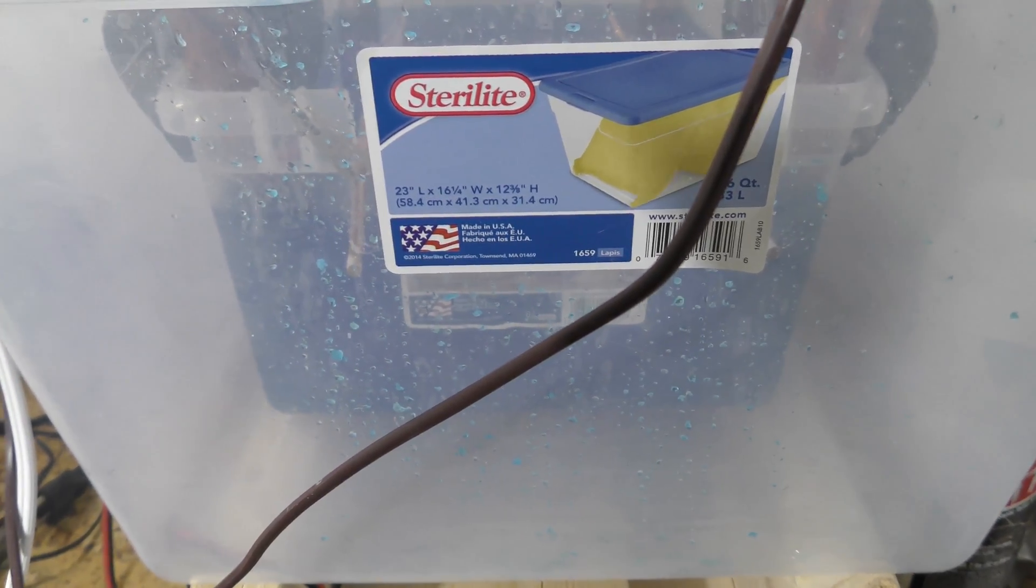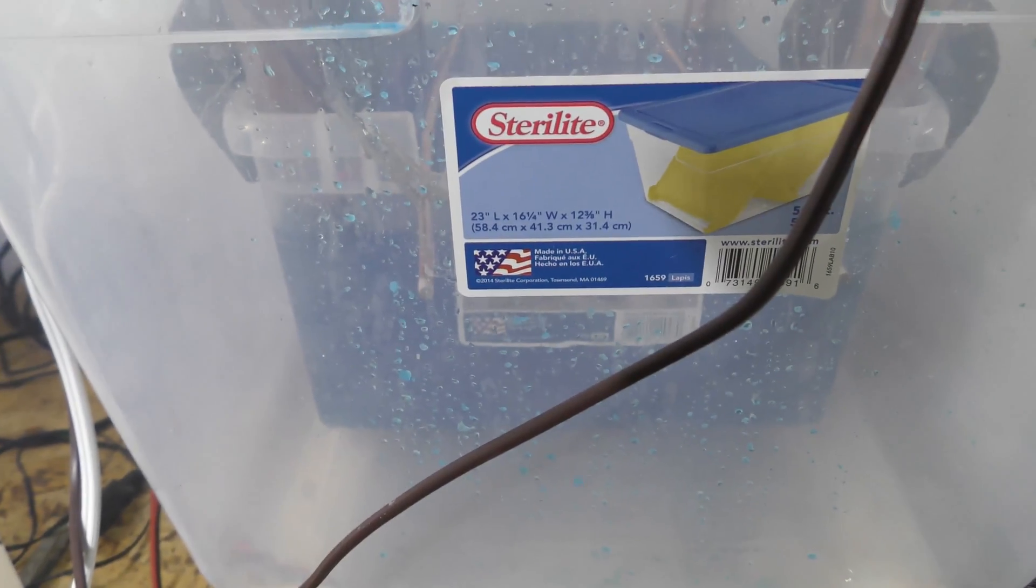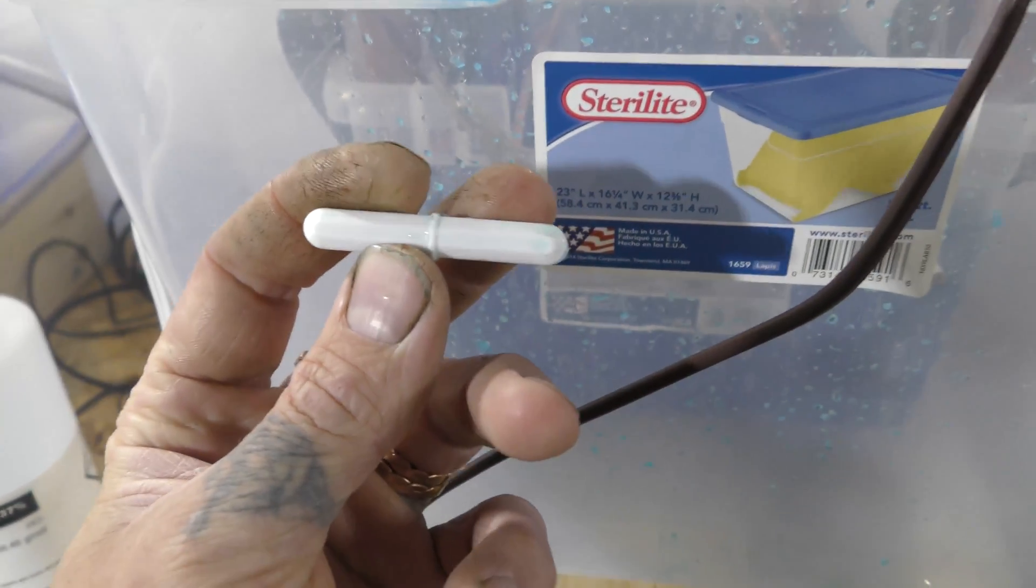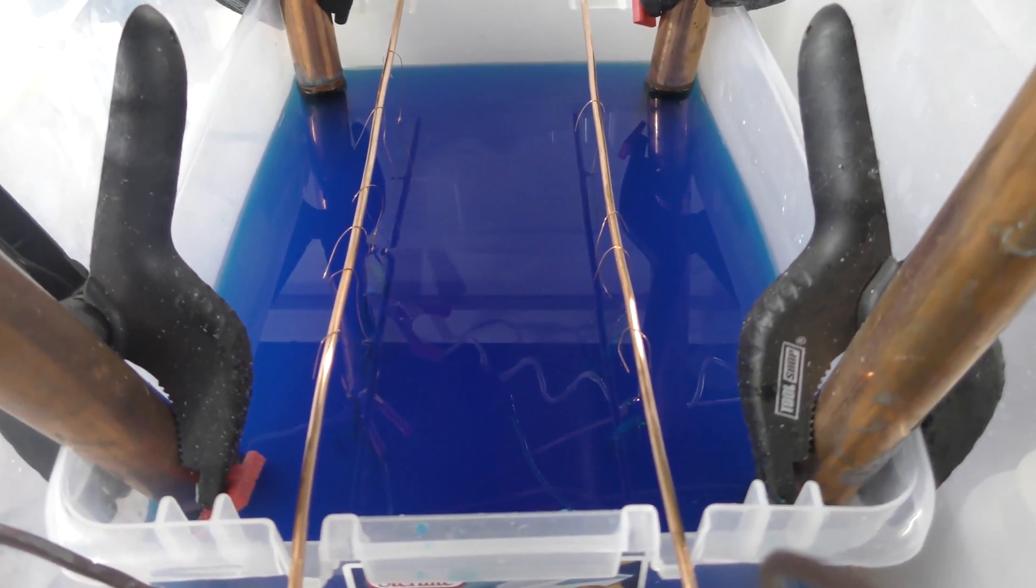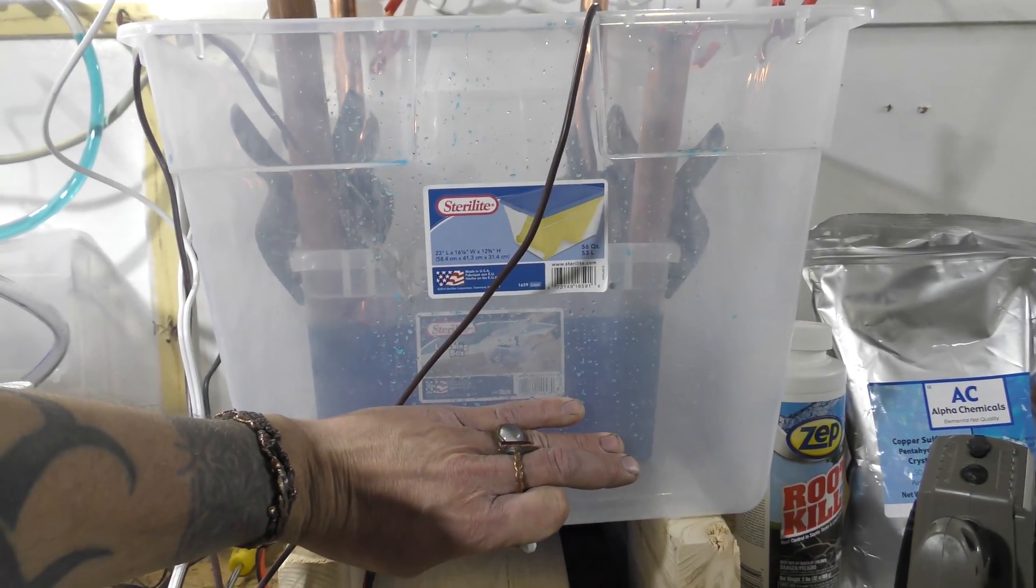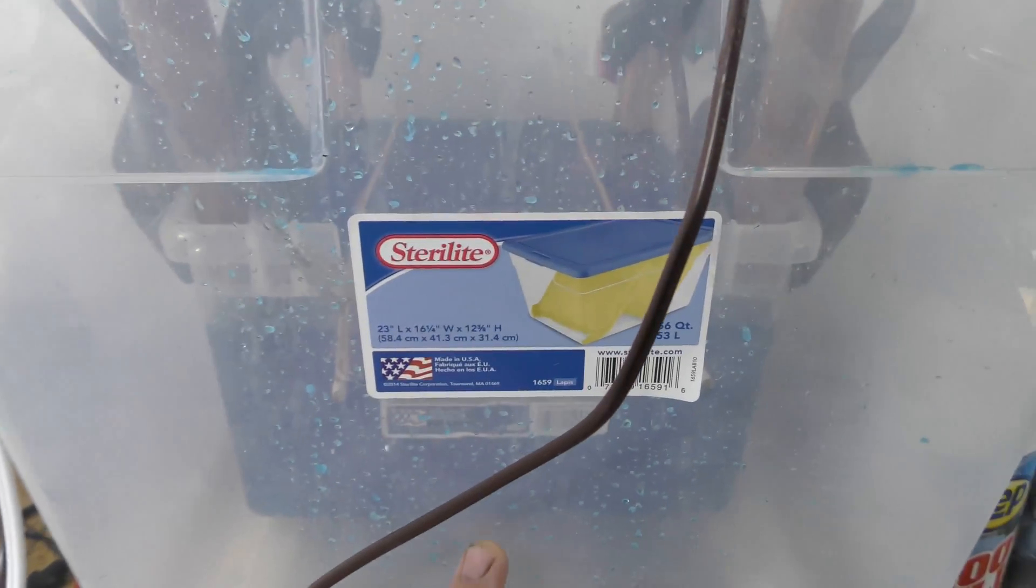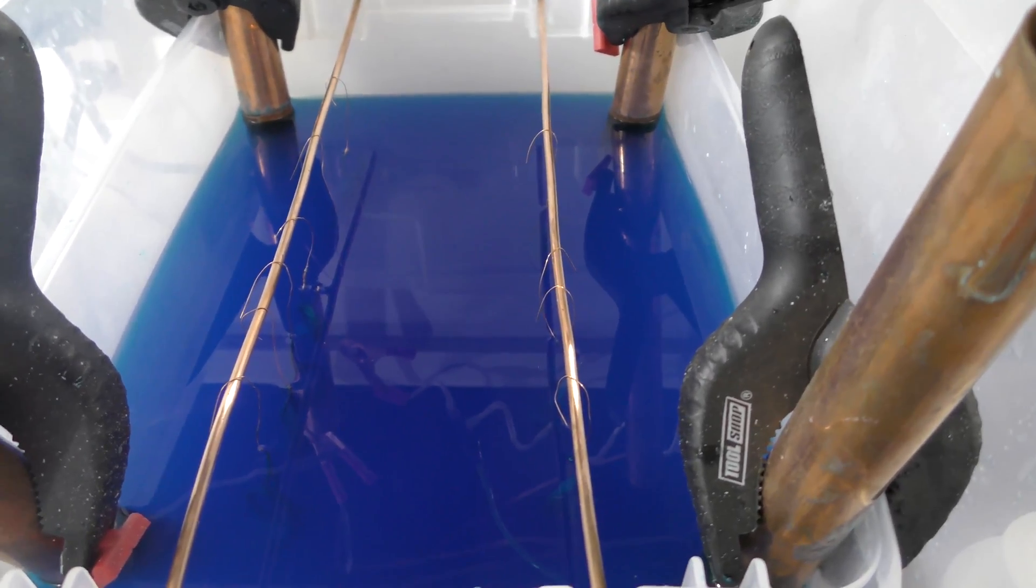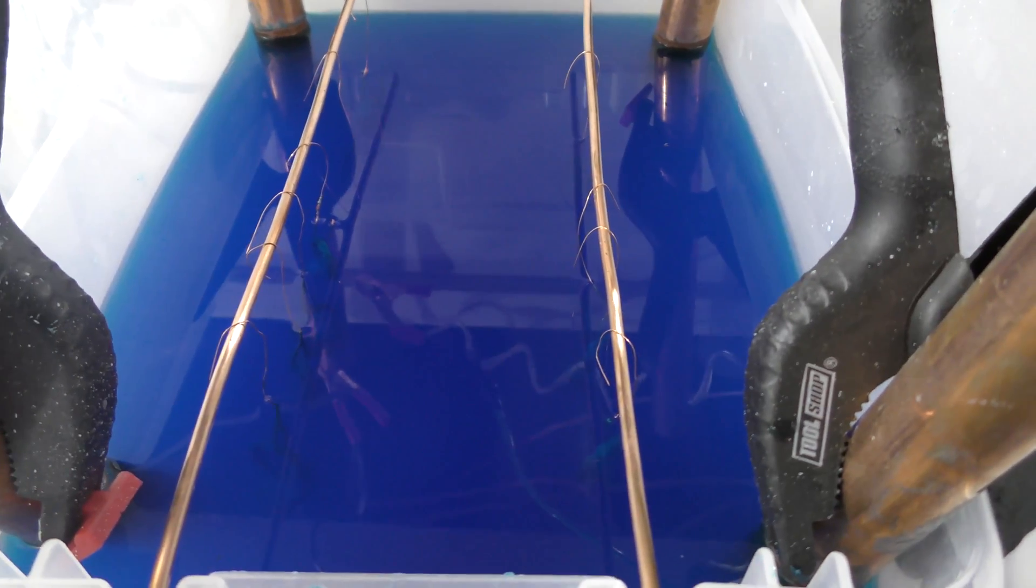What I want to do is show you which ones are the better one at the lowest price using different variations of these things. I would call this a pill. The fact that this thing has two magnets in it, and right now this liquid is about three gallons of liquid. So what I want to do is show you this brand, which is the one I like the most. I'm going to show you that one first, and then I'll show you the alternatives.